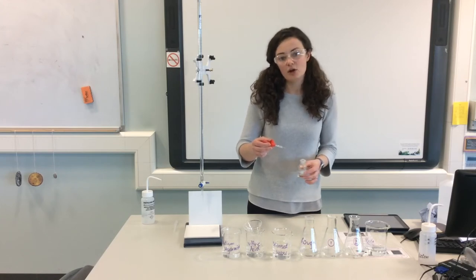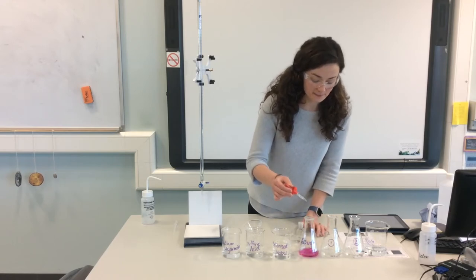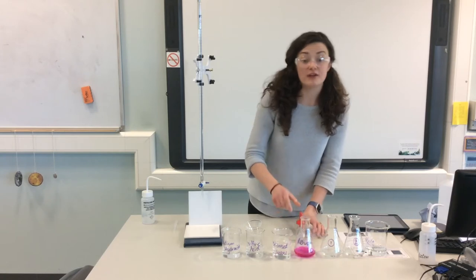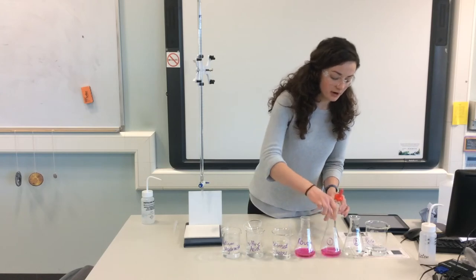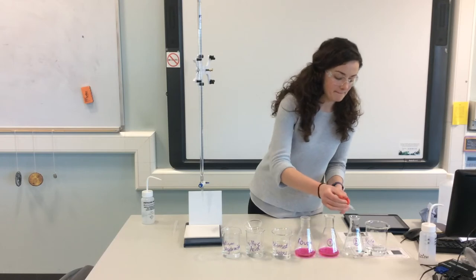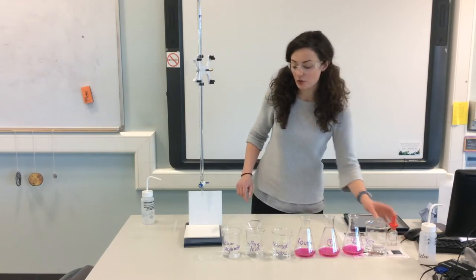So have a think, what colour would you expect it to turn when we add it? Remember, we've got sodium hydroxide in here. So yes, it turns our nice pink colour that's consistent with phenolphthalein in an alkali. So we'll just add a few drops to each: my rough, my first accurate, and my second accurate. Okay, so those are then good to go.